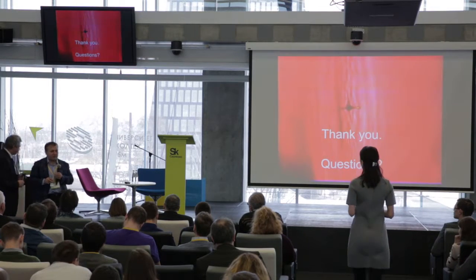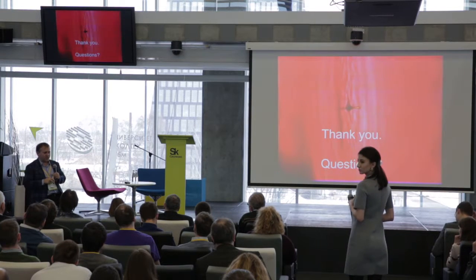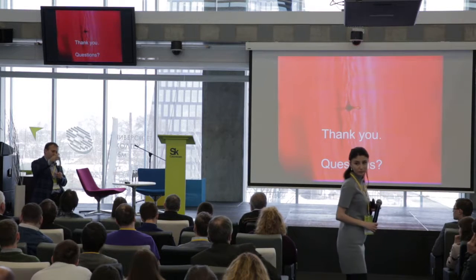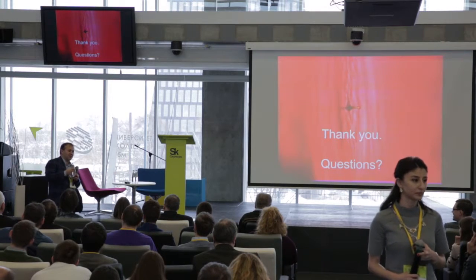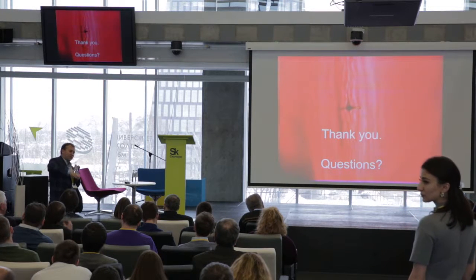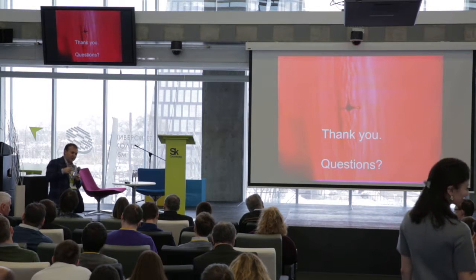Sure. The first part, where you assemble them with Faraday waves, is not an active acoustic wave. It is just a vibration that you do. Oops, so it's an acoustic wave. You're just having the cells see a moving flow at the bottom. So that's really not affecting them.